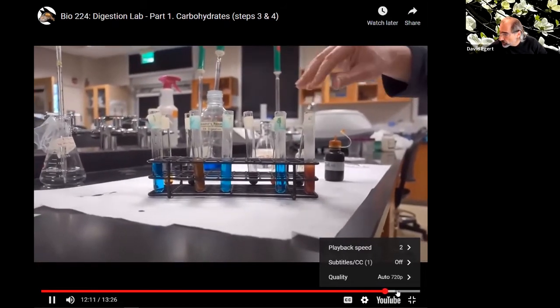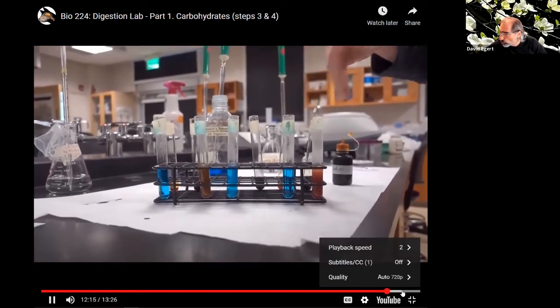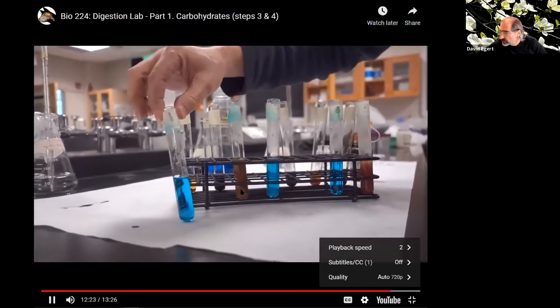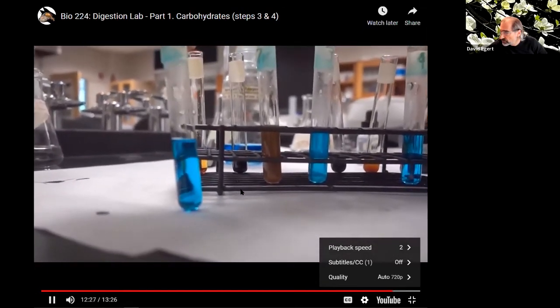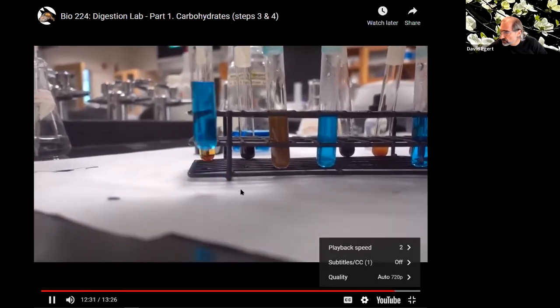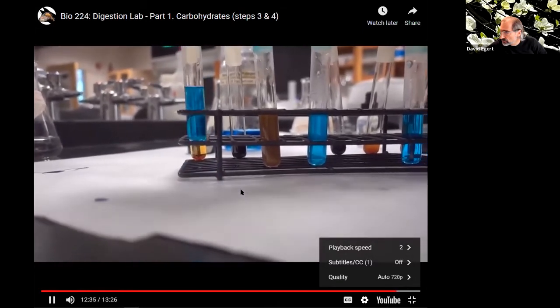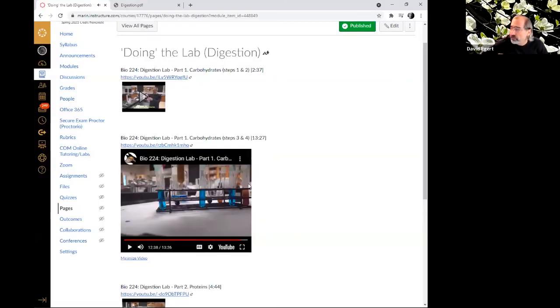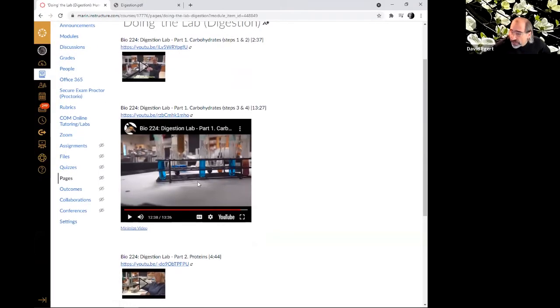So this is great from our control perspective. Starch was negative for maltose, maltose positive for maltose. If we look at our unknowns, this was 1. This was starch just with water. So starch basically on its own after sitting at 37 degrees. Blue means, what does it mean? And why? Right.